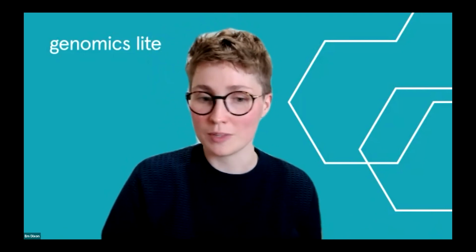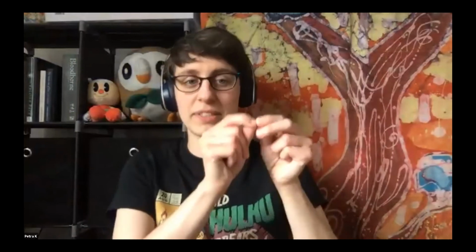Someone's asked a question specifically for you, Petra, asking wouldn't the rehydration step affect the water sensitive wings or body parts of those insects? Yeah, that's a good question. When I say rehydration, I mean specifically water vapor. So we don't dip them in water. This is why I put everything in this chamber. I put a lot of wet paper towels, and I put the little pinned mosquitoes outside, not outside of the box, but outside of the wet paper towels. Close it and leave it for 3 hours.